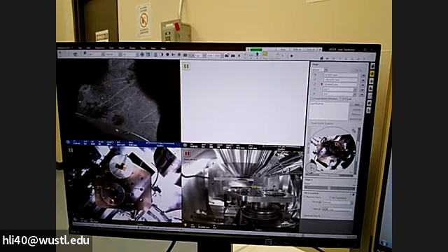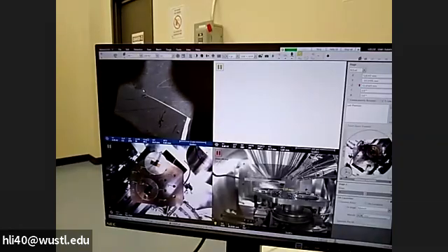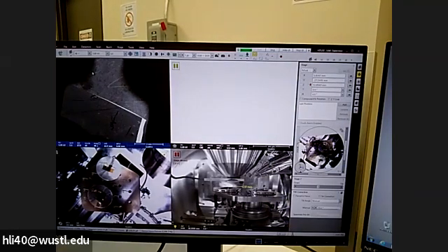So another way, so just now I show you, you double click the place you click will move to the screen center. Another way to drive is click on the middle wheel of your mouse. So middle wheel of your mouse, when you click on it, you will see yellow circle there. So if you move the mouse to the direction, it will like you are driving. Now I'm trying to drive along the edge.